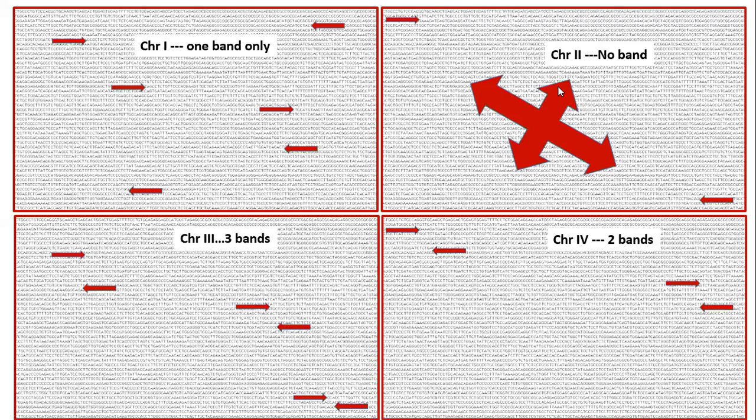In RAPD technology, how do you distinguish 4 chromosomes of a given human being? You design a specific random primer. You use the random primer as forward and reverse, both the same, and then you start annealing it in the PCR reaction to all the genomic sequences based on the location of this primer complementarity.